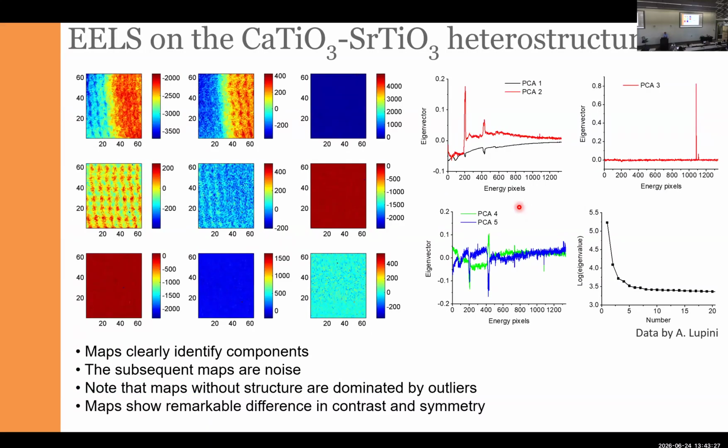So as the example, you always have to experiment with the... We always need to answer the question, where would the labels come from? So we can do it exactly the same way as we did for the linear methods. Practically, it is a super good idea, when you have an unknown data set, to always start with the unsupervised analysis. So always start with the PCA and the clustering. And sometimes it gives you things that are super useful.